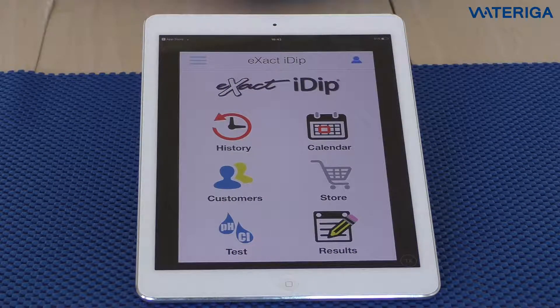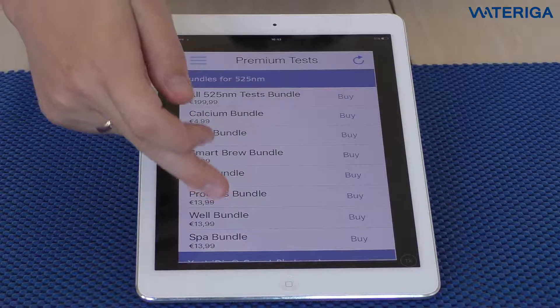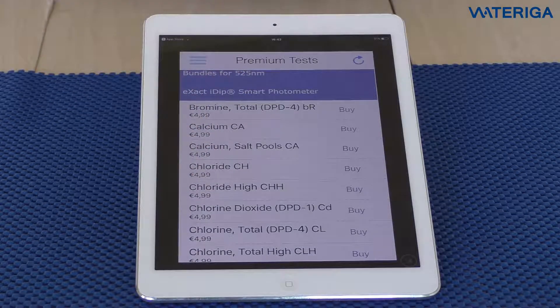In order to use the i-Dip smart photometer, you will need an algorithm for each test. Four algorithms come pre-installed free in the app: free chlorine, combined chlorine, pH, and total alkalinity. If you would like to do any additional tests, you will need to go to the store and buy them. Hit store, and you can see all available algorithms there. They will be updated as new algorithms are developed and will be available for everybody to purchase.